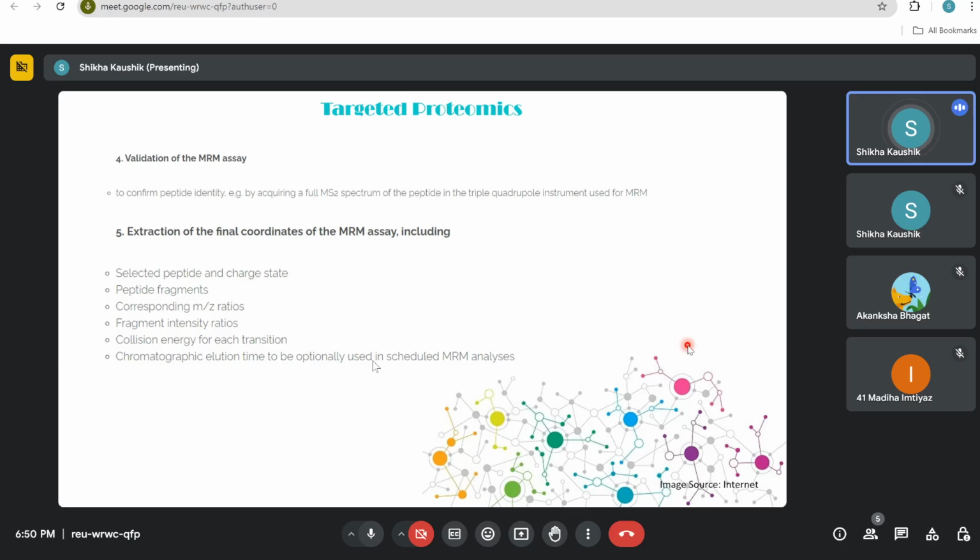So वो सब आप करते हो. वो आप कैसे करते हो, जब आप अपना पूरा स्पेक्ट्रा आपको मिलता है, because that spectra will give you details of your amino acid present in a particular peptide fragment. फिर आप उनको combine करके check करते हो that whether this is the peptide that you want to study. So these are the ways that where you do validation and you have your proper data.